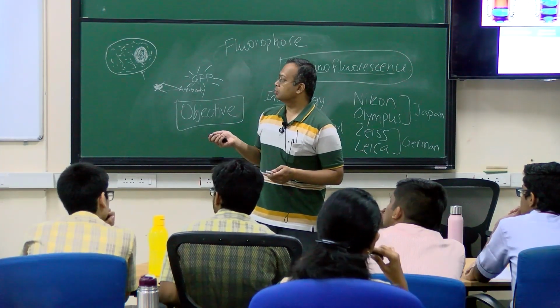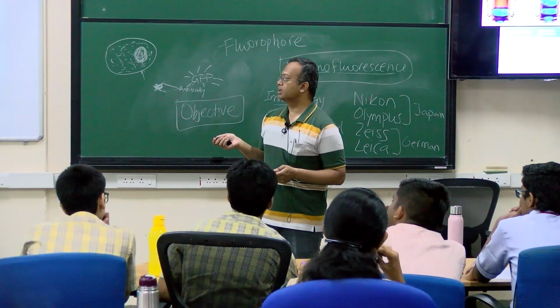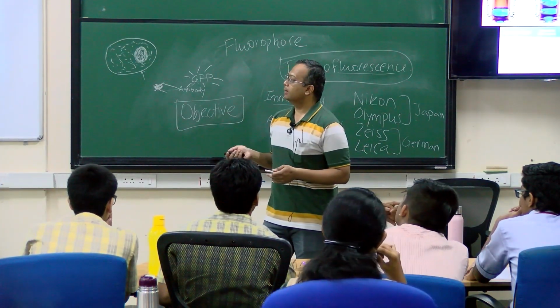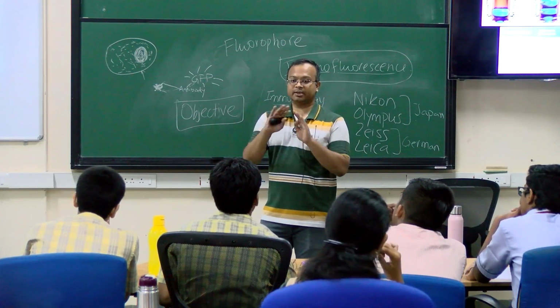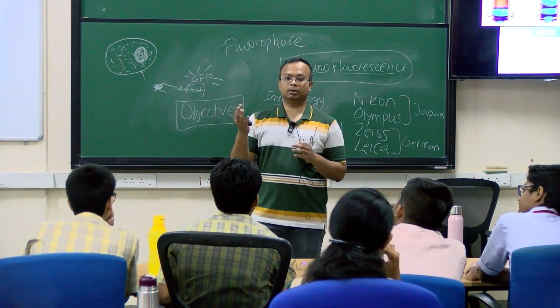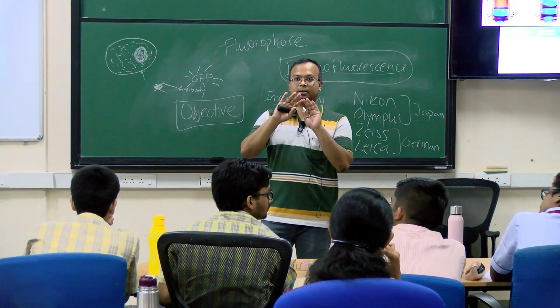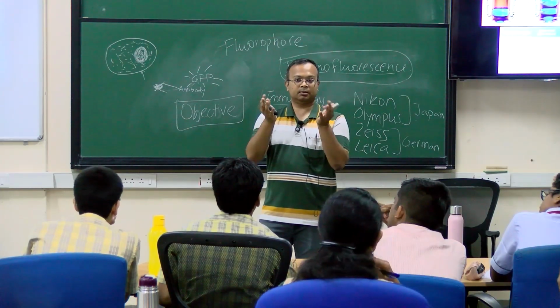So with chromatic aberration, different microscope objectives differ: some can correct for 2 colors, some can correct for 3 colors. And then there is spherical aberration. Sometimes a flat object can appear rounded. When you look under some cheap binocular, you will see things bulging in the corners. It is curved.